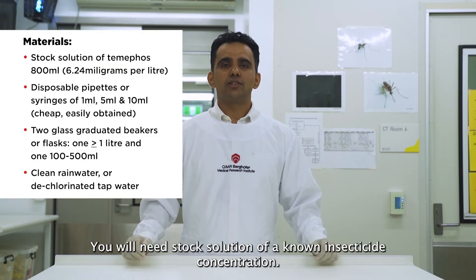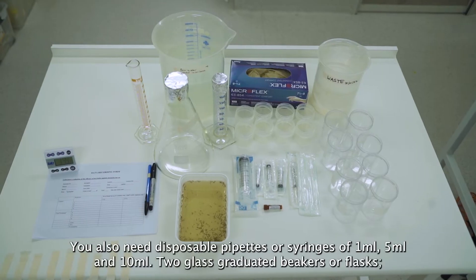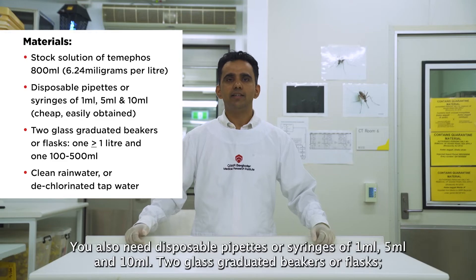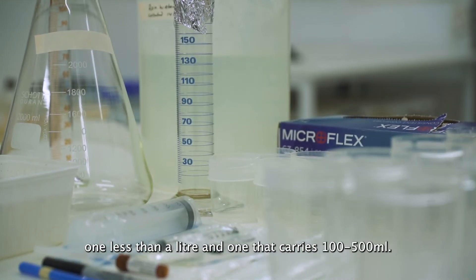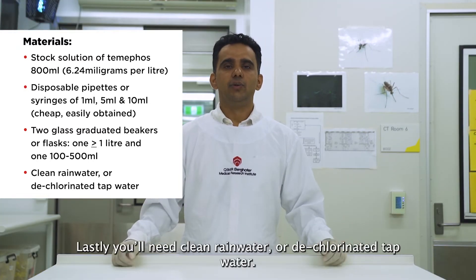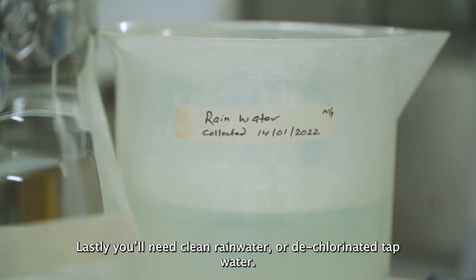You will need a stock solution of a known insecticide concentration. You also need disposable pipettes or syringes of 1 ml, 5 ml, and 10 ml. Two glass graduated beakers or flasks — one less than a litre and one that carries 100 to 500 ml. Lastly, you will need clean rainwater or dechlorinated tap water.